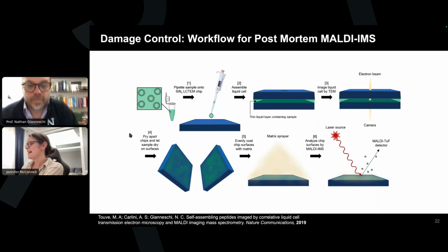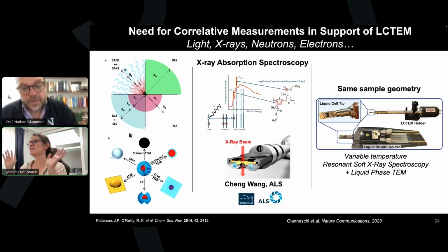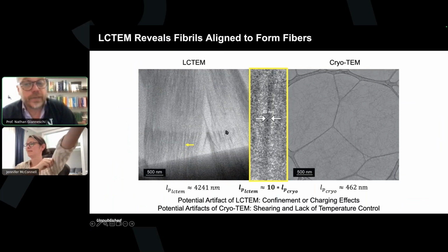Very good. Yeah, we get these questions a lot, and I think people will dive right into in situ TEM with a new material, and they're like, oh, it's damaged. I don't think this will work. But I really think there's a lot of workup you can do ahead of time to try and make that successful. I would say, actually, I didn't say it, but you would know intuitively, the cryo experiment is key, right? If you get no contrast at all, you're not going to see it in liquid, right? So there are some simple things like that.